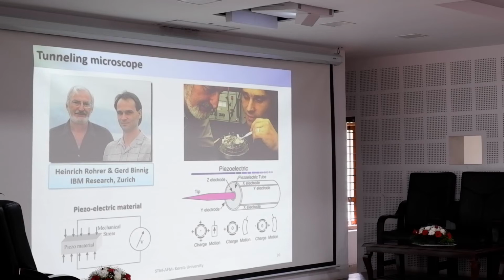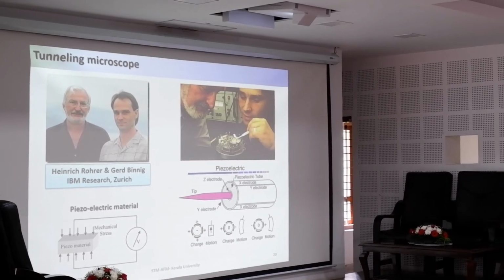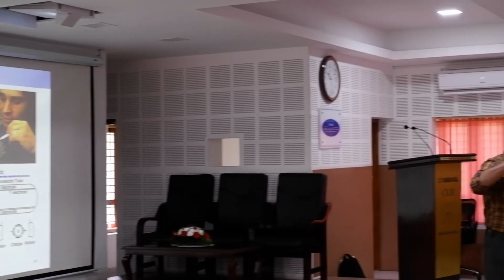Yeah, that vibration you have to take care of. All vibrations you have to take care of, but this vibration will be very small. I skipped that part actually. It's not in one stretch. It is coming down. It's called stick-slip. I think I have a slide on that. Let me see.